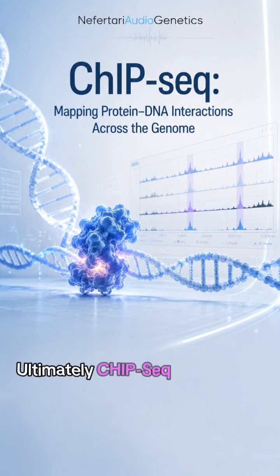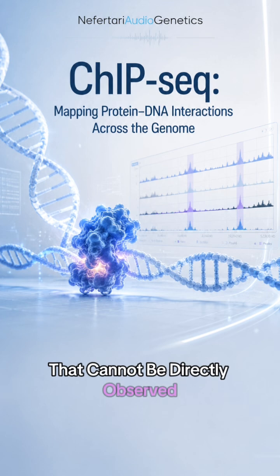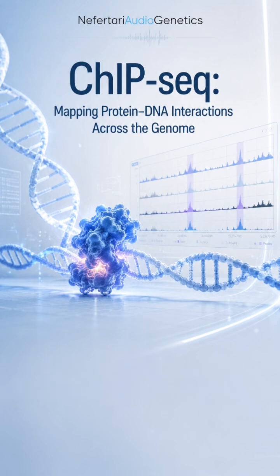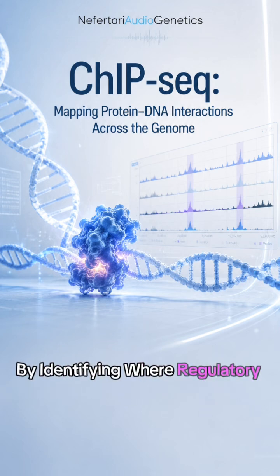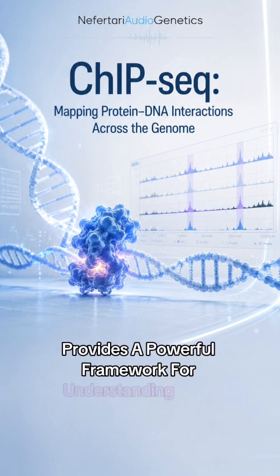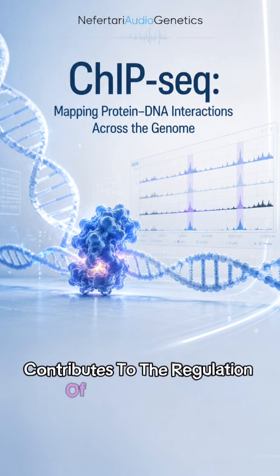Ultimately, ChIP-seq transforms protein-DNA interactions that cannot be directly observed at the genomic scale into a measurable genome-wide map. By identifying where regulatory proteins and histone modifications are enriched, ChIP-seq provides a powerful framework for understanding how chromatin organization contributes to the regulation of gene expression.